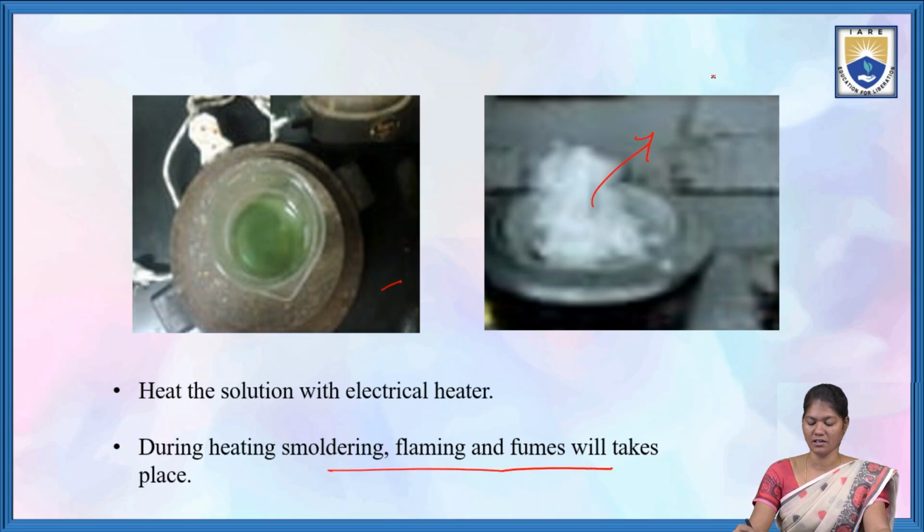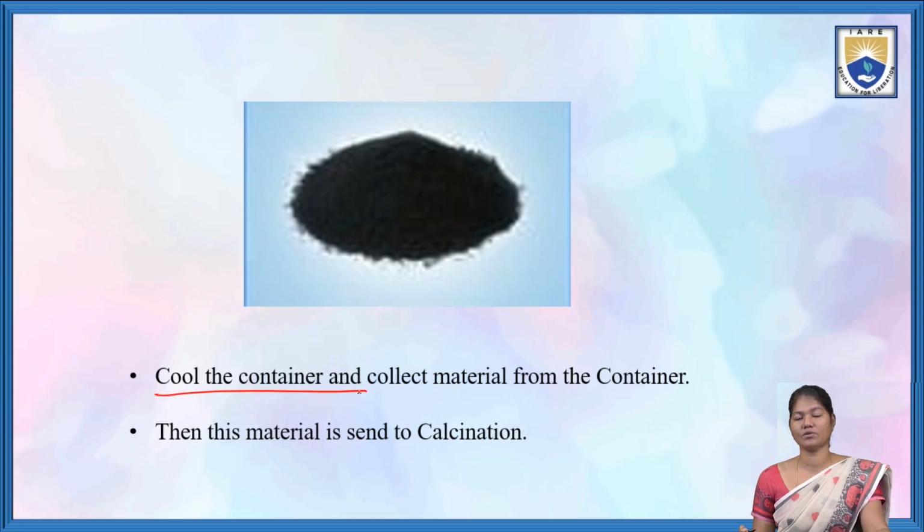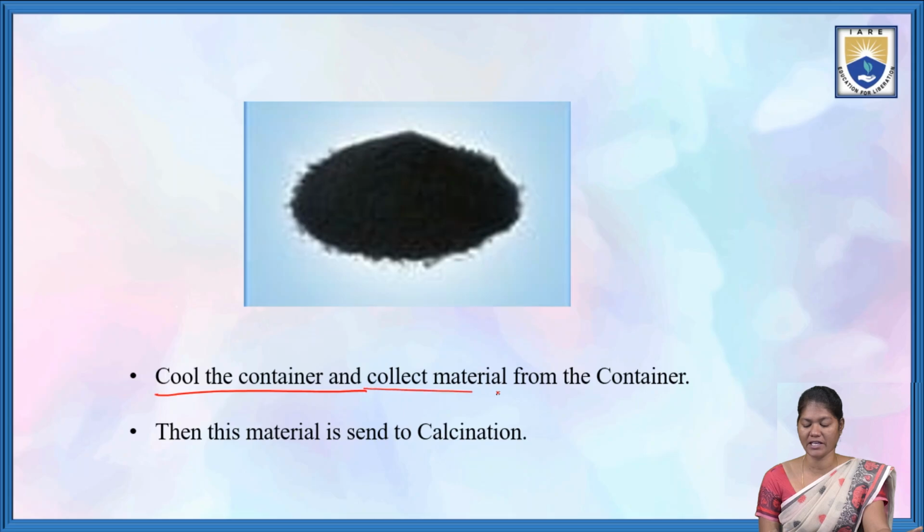Here we can see the fumes. After cooling the container, we can finally get a new product in the container in the form of an ash-like powder.